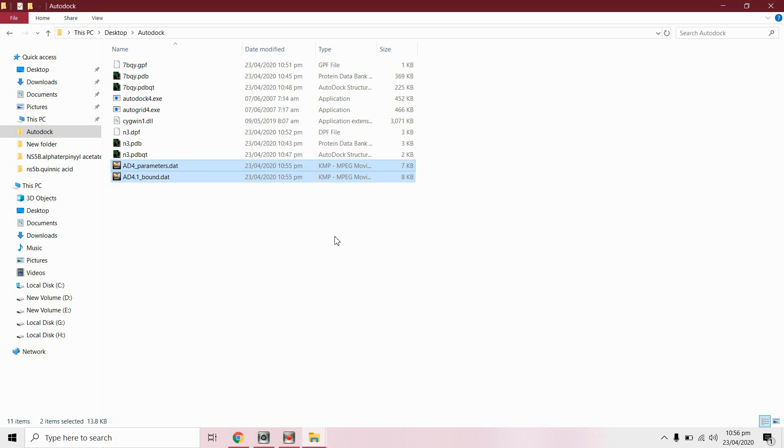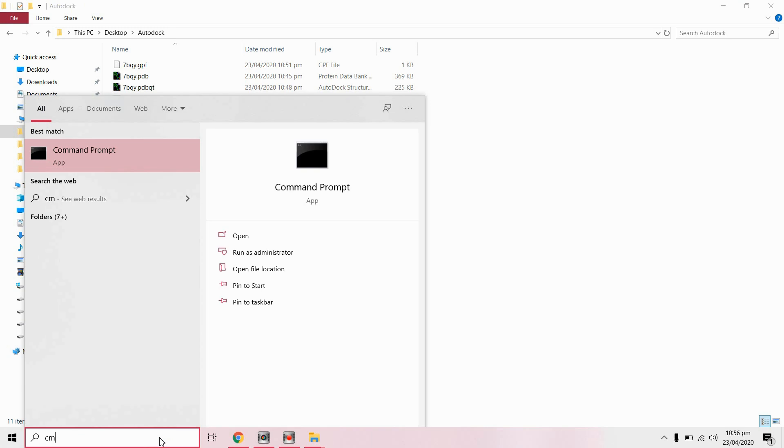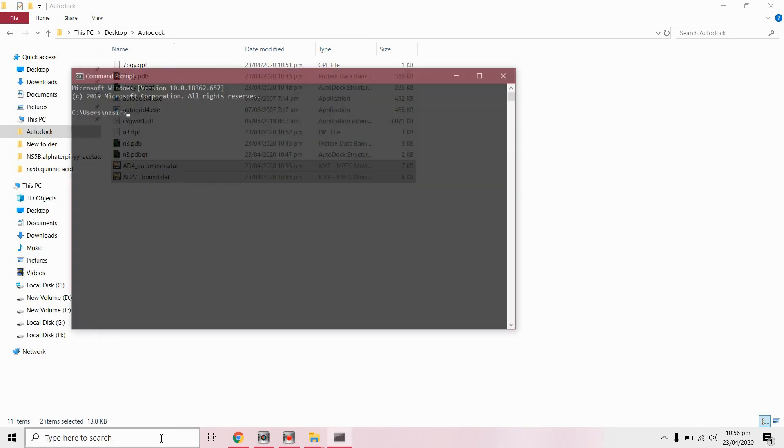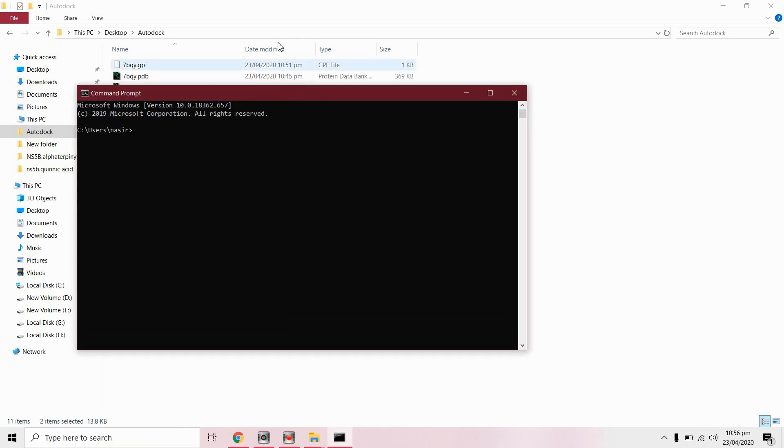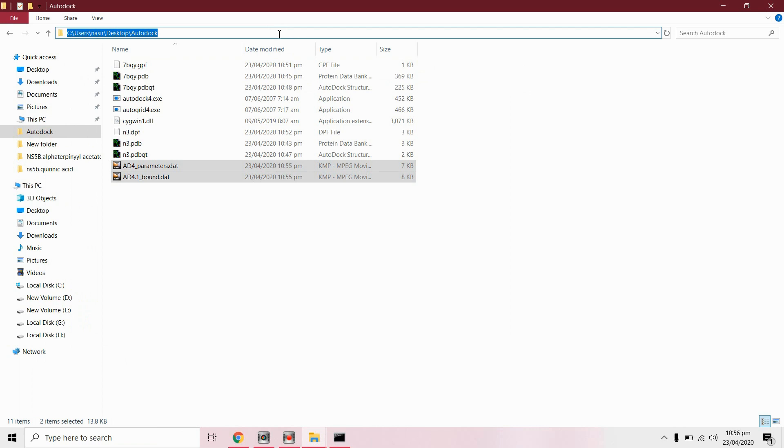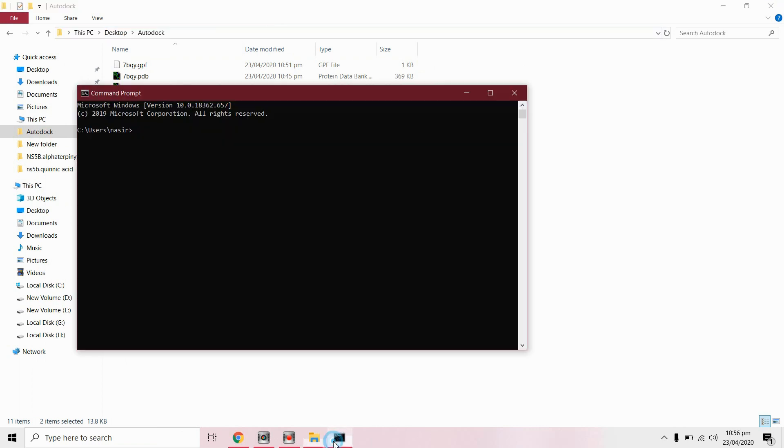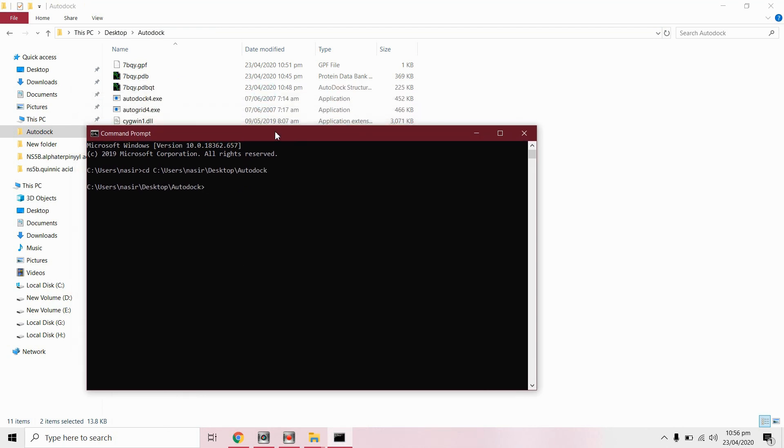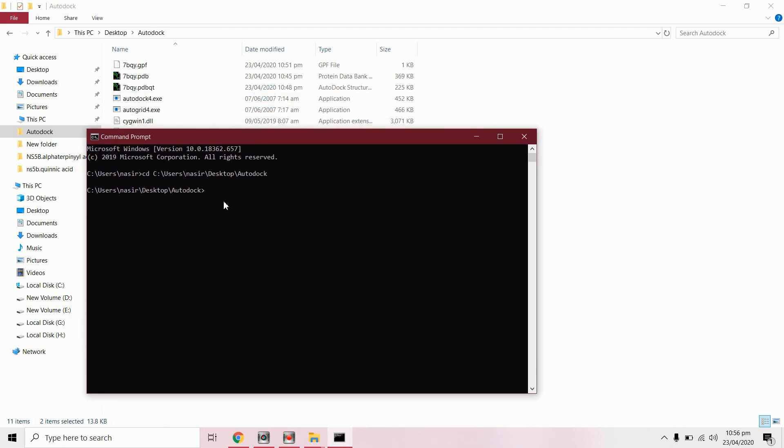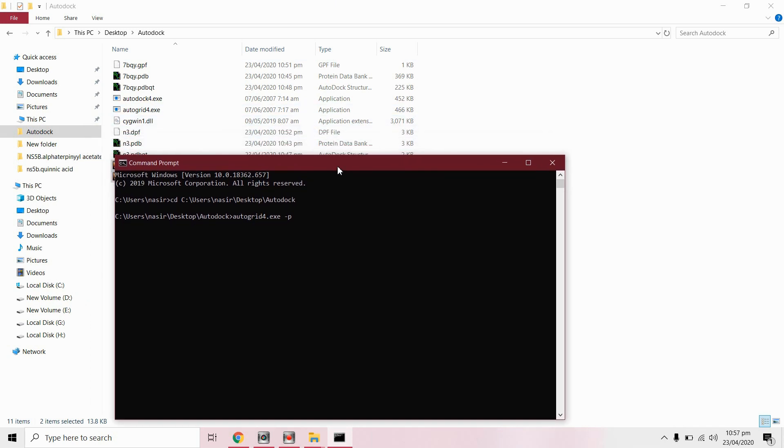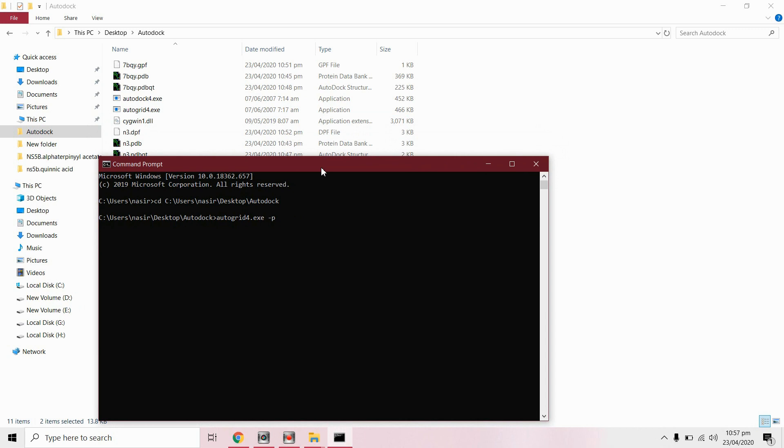Now we are ready to perform docking. For this we need to run command prompt. Change the working directory. First we run AutoGrid 4.exe and then we run AutoDock 4.exe. Minus P, this shows input file which is for a grid file, we have this 7bqy dot GPF.